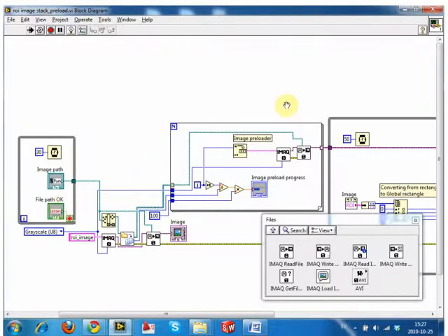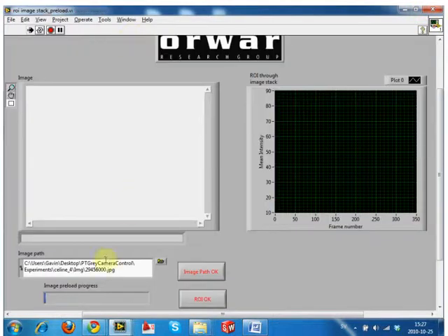So essentially I'm allowing people to load the file path, and rather than showing something straight away, it's like, are you sure it's okay? And if you're sure it's okay, you hit okay. If you're not, you re-choose it. Because what it does is it displays the file and lets you draw the box and move it around while it's running all of the images into memory.